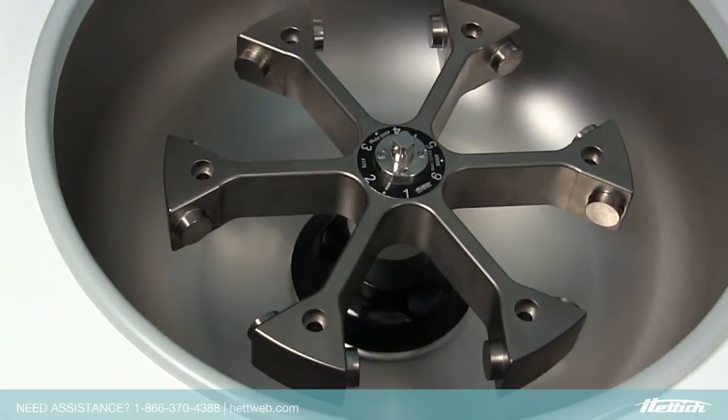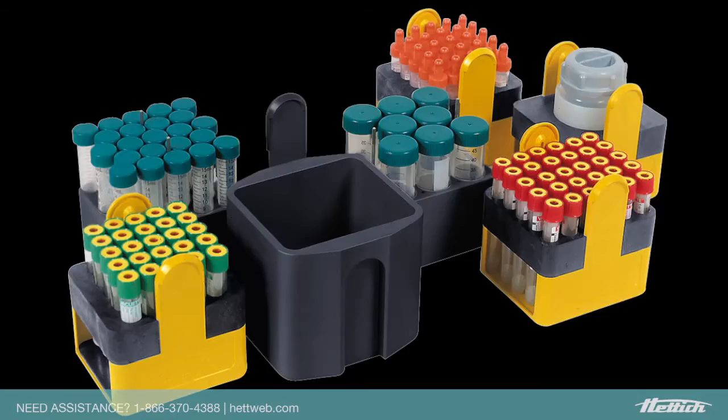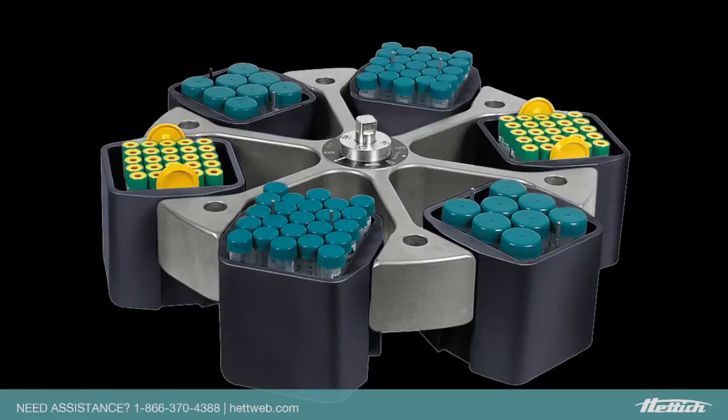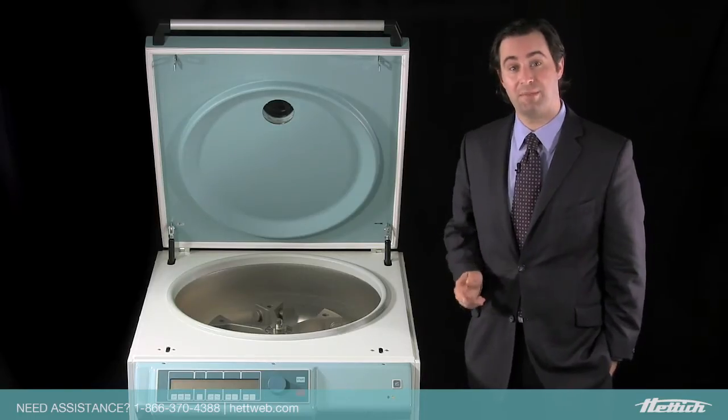Our unique VersaRotor allows you to spin a combination of bags, tubes, and bottles in a single rotor. It's available in both a 4 and 6 place option, and can help save you both time and money.